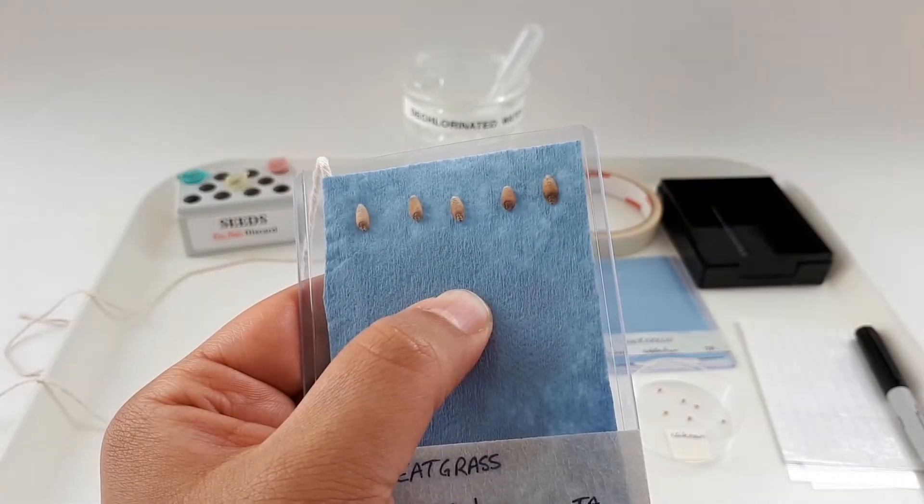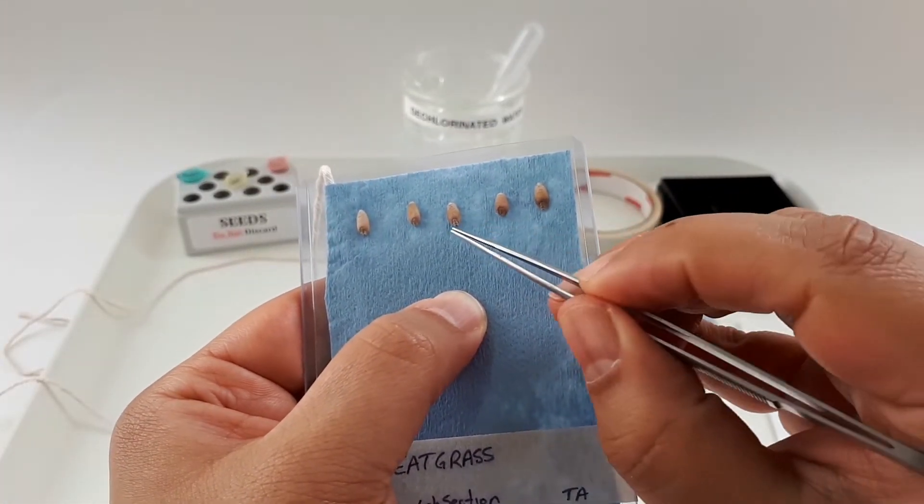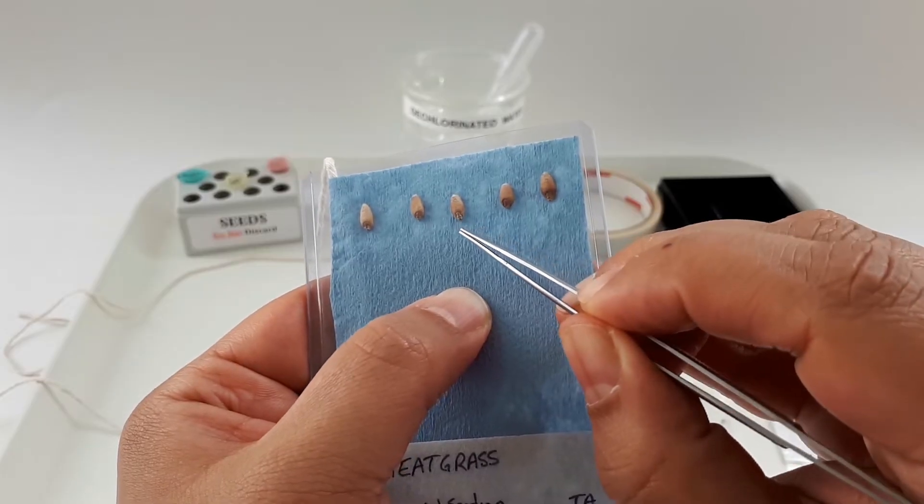For the wheatgrass seeds, make sure that the little knob on the bottom that houses the dormant embryo is pointing downwards.